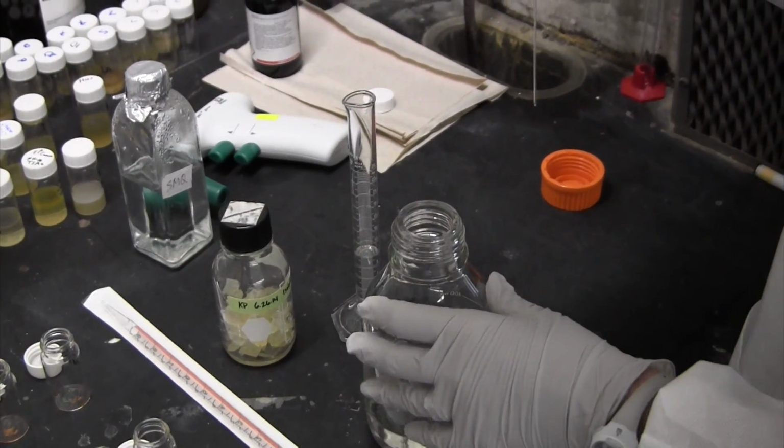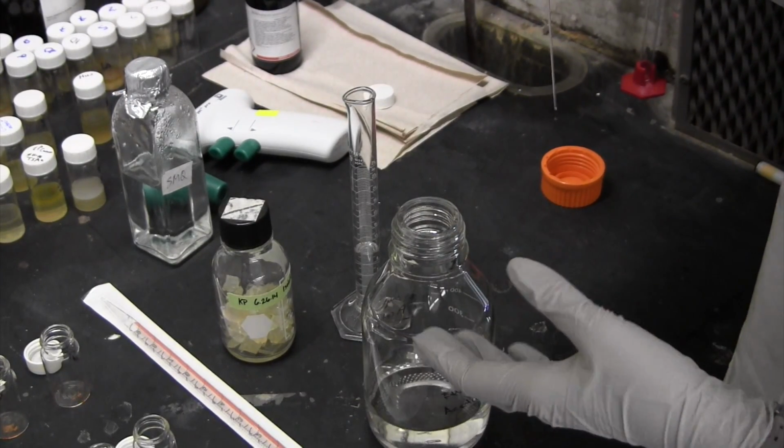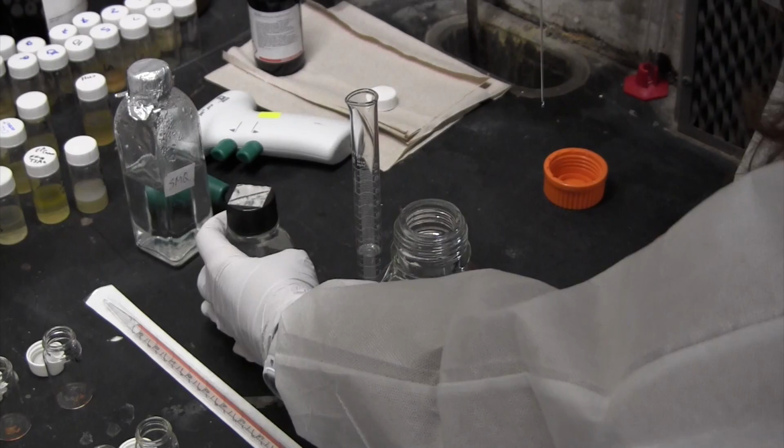Okay, so we're now continuing our chemical extraction. We've cut up our agar, we put it in a glass jar, and we've frozen it down either in a dry ice ethanol bath or at the -80. And so our frozen agar is now here, and the next step is to add ethyl acetate.